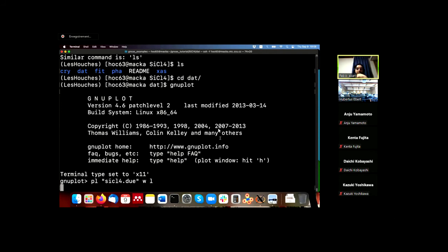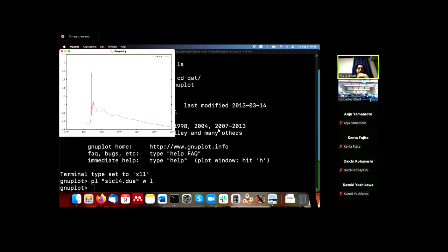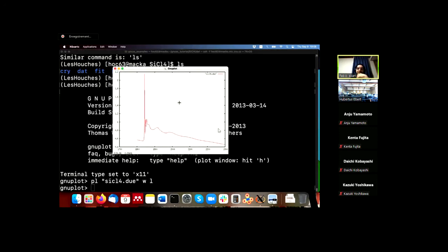Okay, now no error, but maybe it's slow. Yeah, it's slow because I'm in Japan, so it takes time to arrive here.